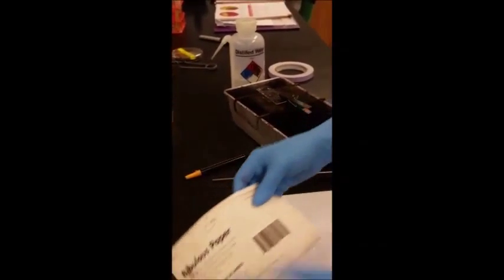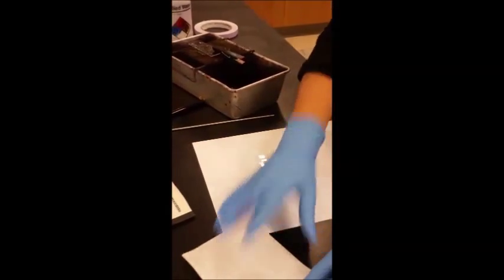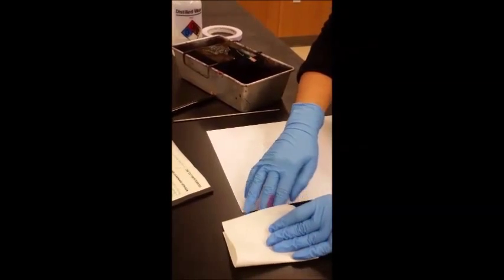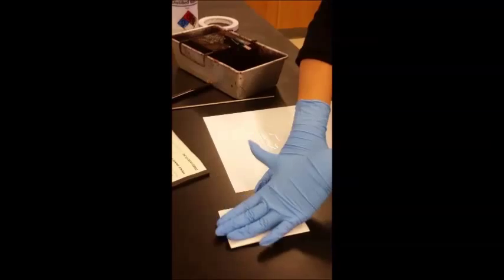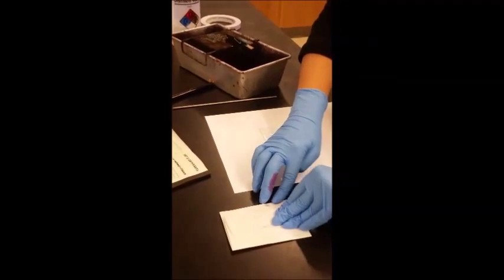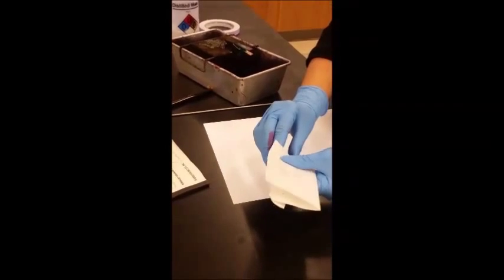And then we use the bibulous paper to dry it off completely. We detach the clip. And then we put the slide on the paper. We fold it and we gently tap. Very smooth and gently. And the slide is now ready to put under the microscope. Make sure the slide is dried enough.